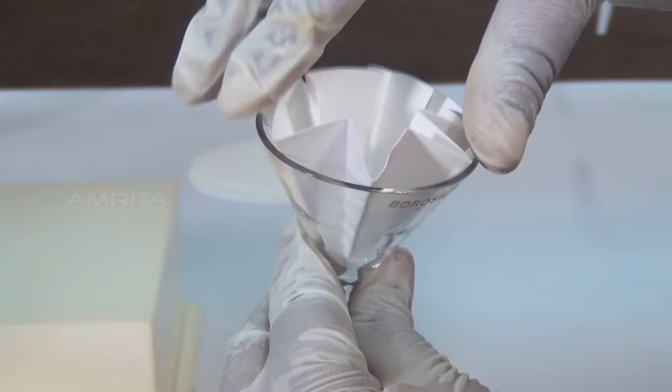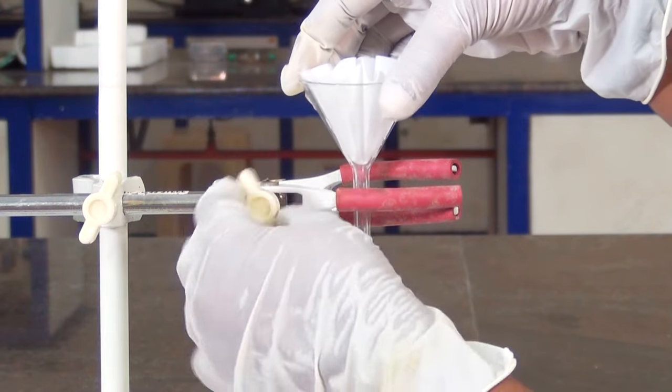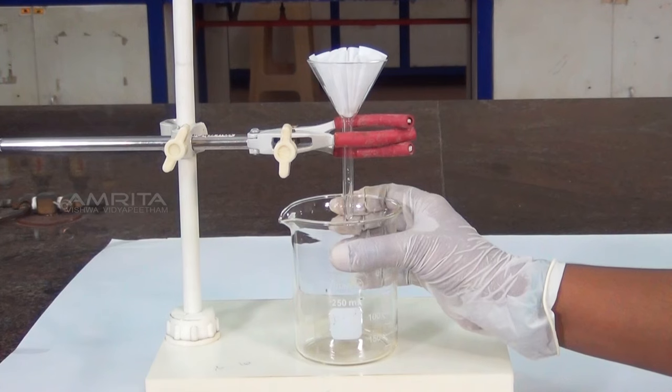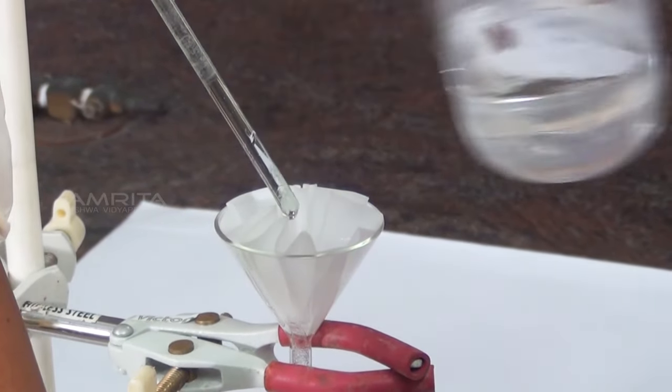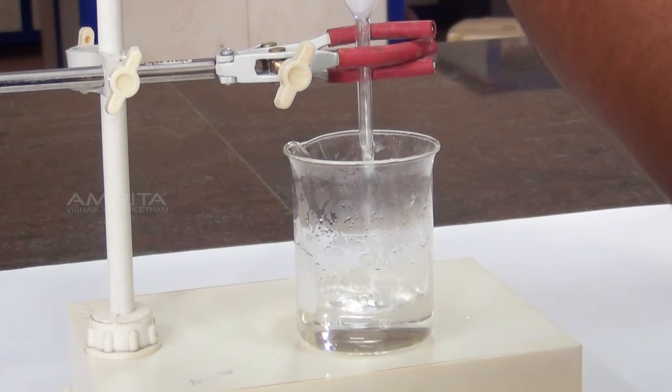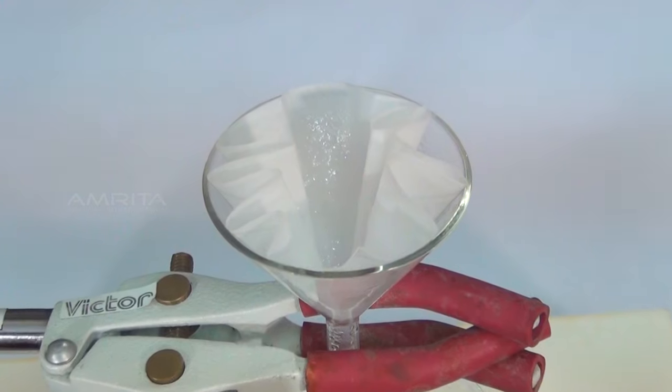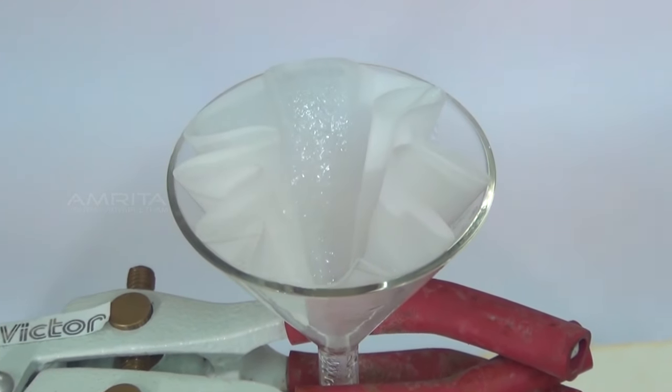Place a fluted filter paper in the funnel and clamp the funnel to the stand. Place a beaker under the funnel. Pour the solution into the funnel over the glass rod and collect the filtrate in the beaker. The insoluble impurities are left on the filter paper.